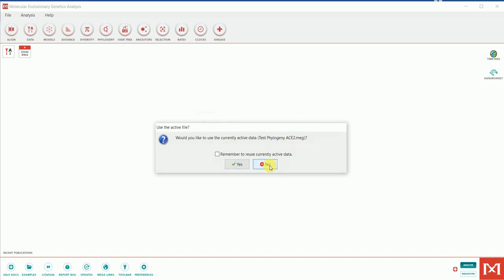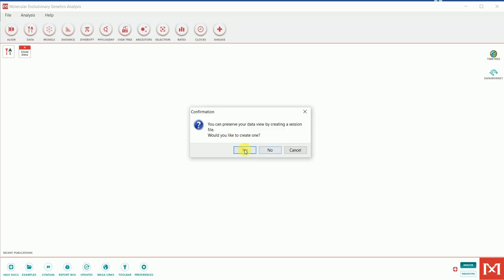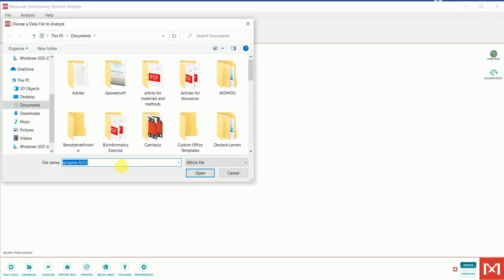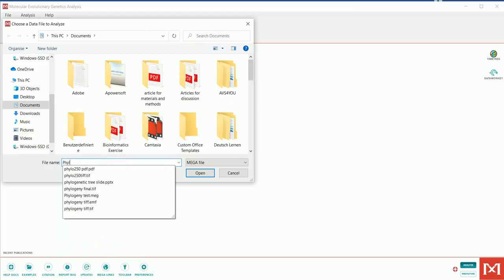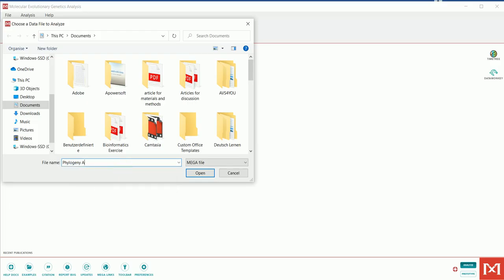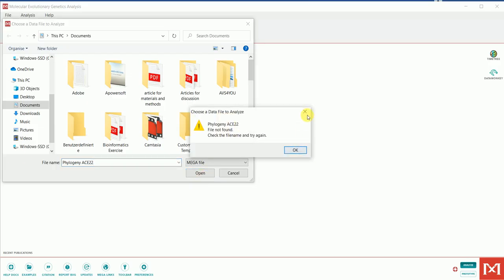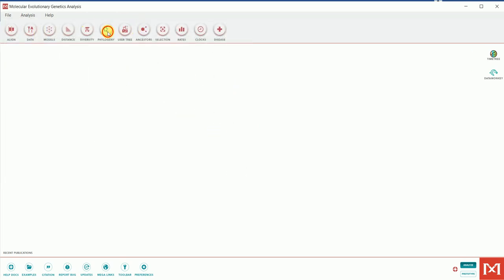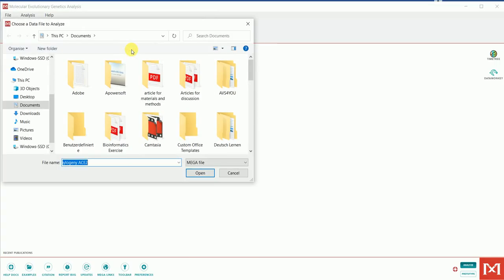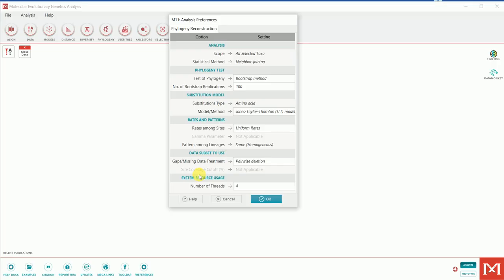It asks whether I want to use currently active data — I'll press No. Then it asks me to locate my alignment file. The file I saved was called 'phylogeny_ACE2.' I'll navigate to it, find that file, and press Open. This loads the saved sequence alignment into the program for tree construction.